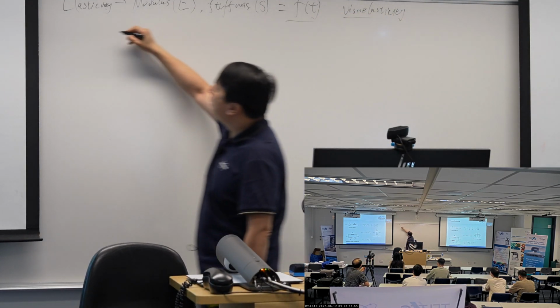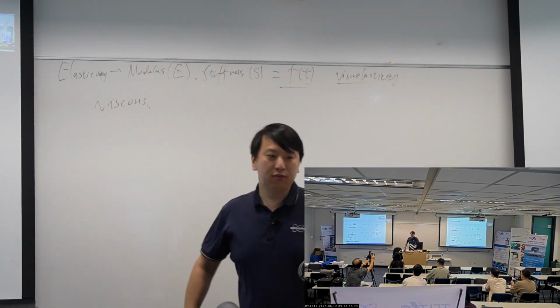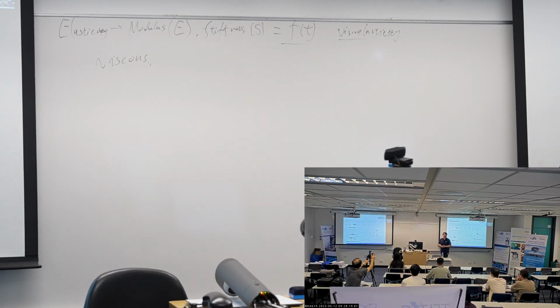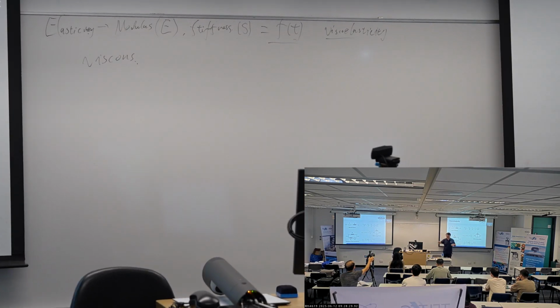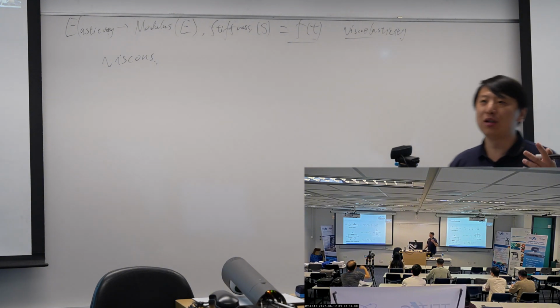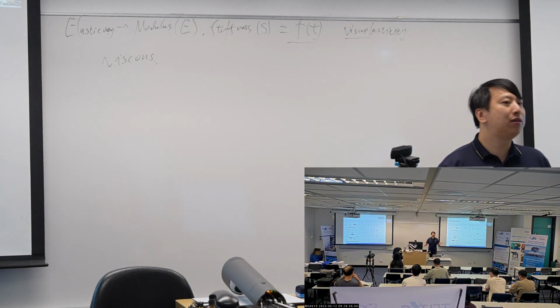When they say viscous, in Chinese it's 粘度. It describes the property of a liquid or fluid. When you touch alcohol, you can feel the viscosity of alcohol and water is not the same.